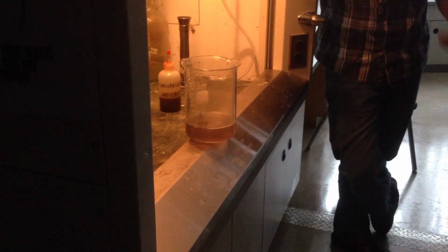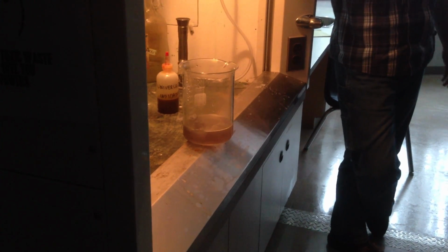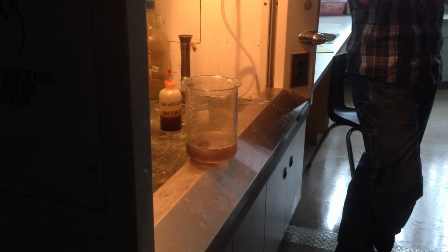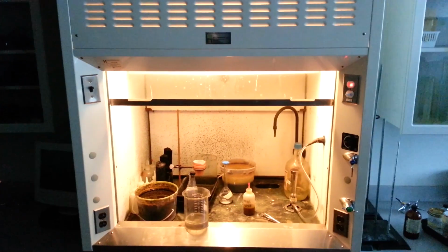You put a chunk of metal in and it floats and it makes bubbles, but was it all whiz-bang and super cool or just meh? Meh. And that's because we're at one end of the scale in terms of alkali metals. That's the top alkali metal. Next one down on the list is sodium.